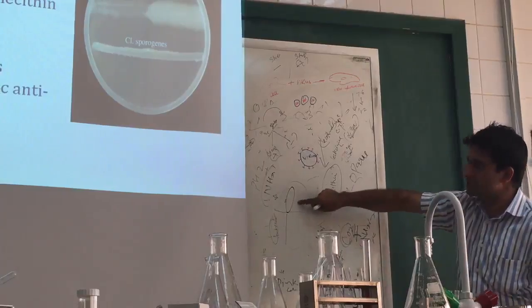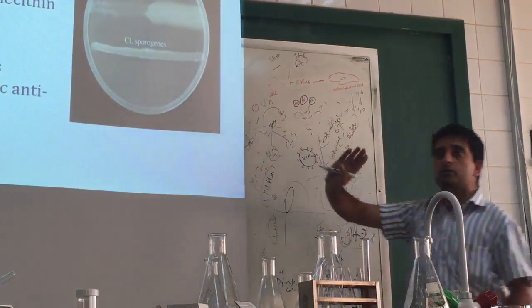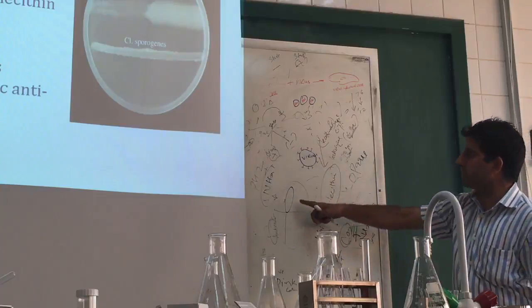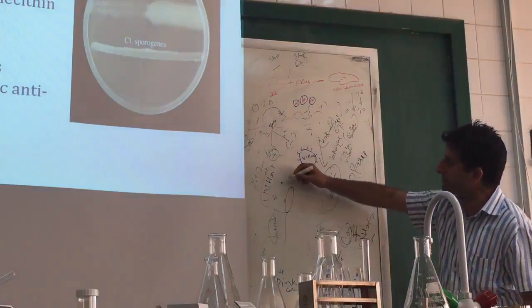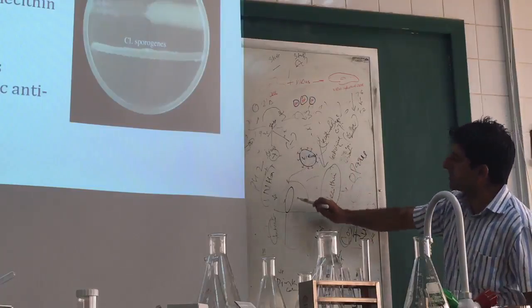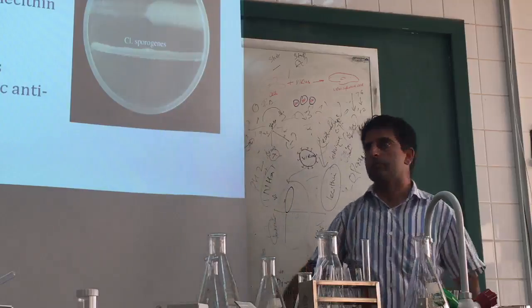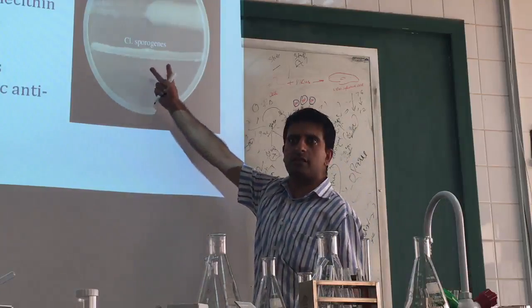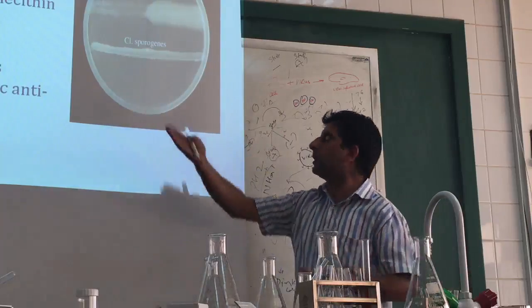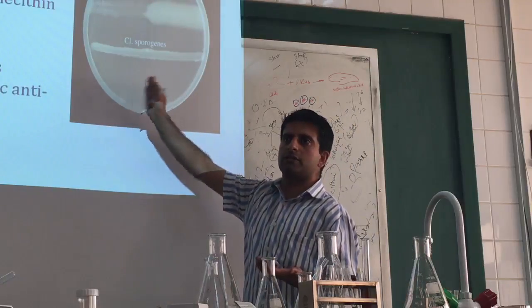But on this side there is no antitoxin present, but lecithin is there. The lecithinase enzyme of the bacteria attacks it and it's like this. In this other organism, there is absence of this enzyme. So you see there is growth here and here, the same, because when there is no presence of the enzyme, there is no breakdown of lecithin.